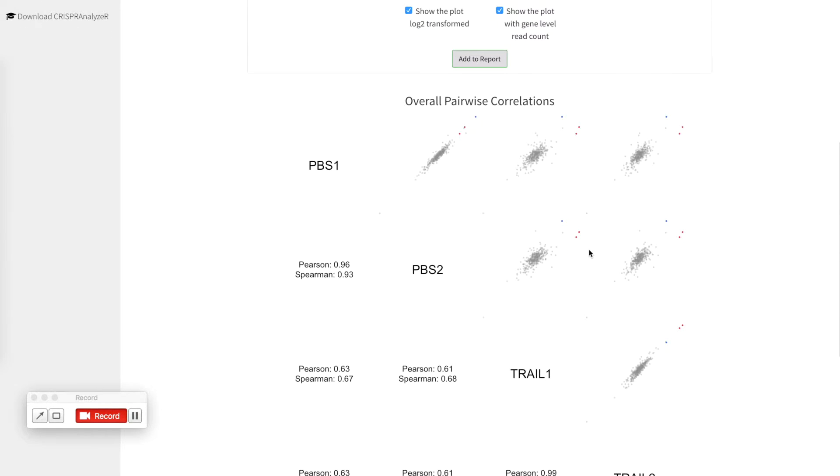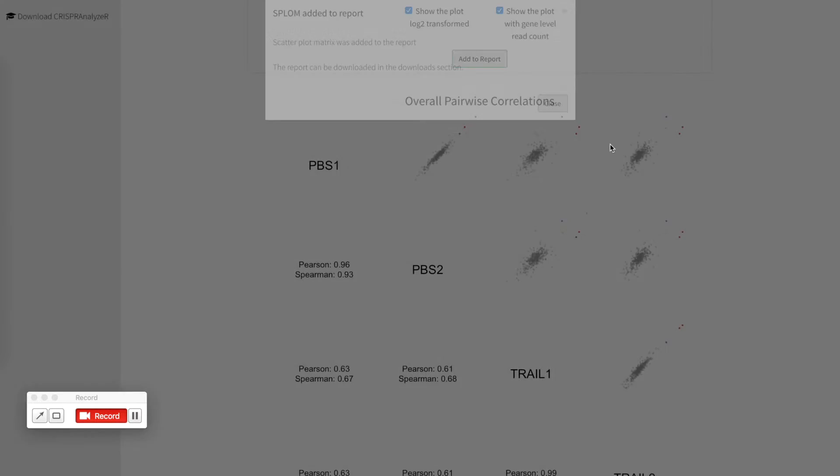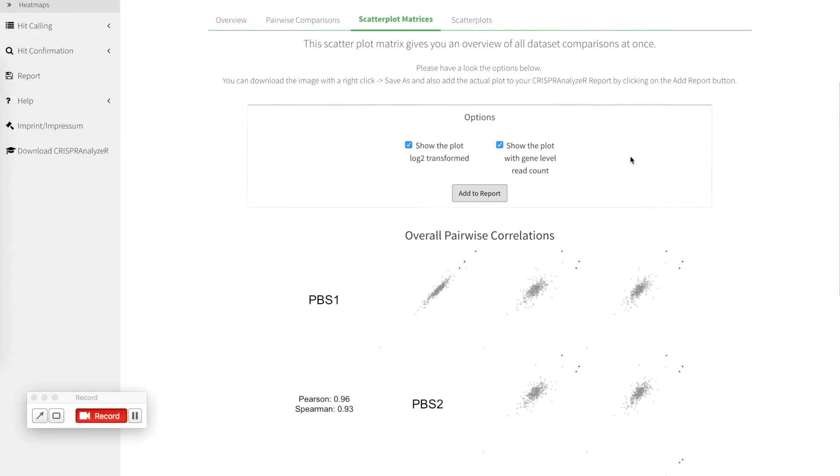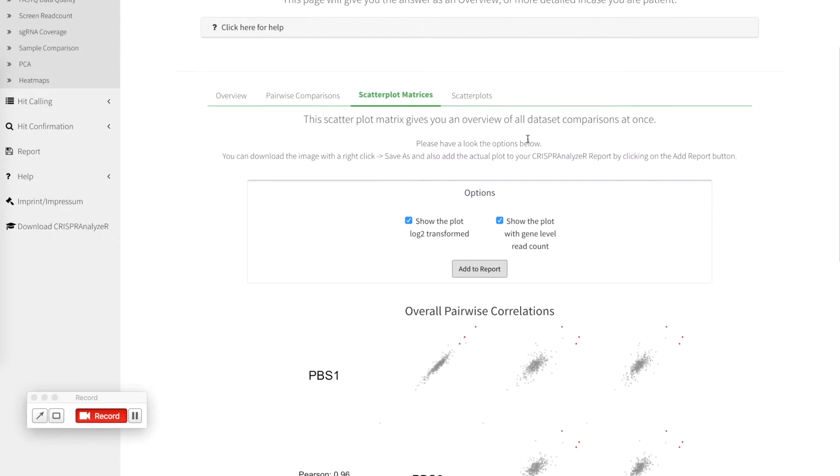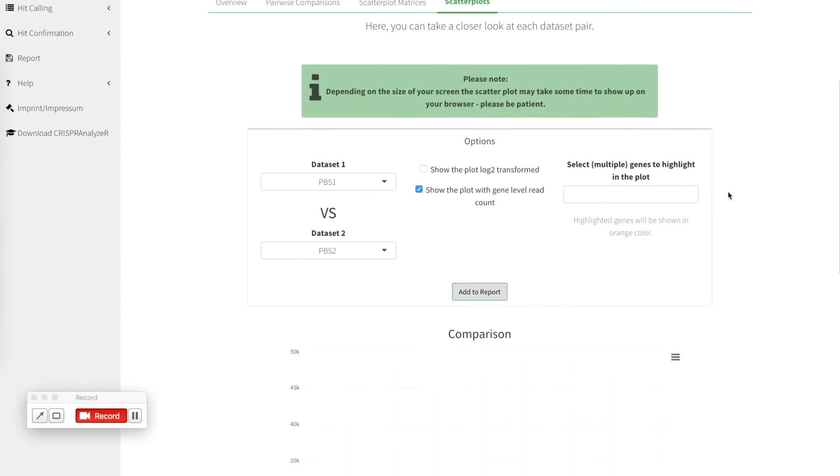If you want to have this plot included in your report, click add to report and CRISPR analyzer will tell you that this section has been added to your report. You can go on with some scatter plots for more detail.